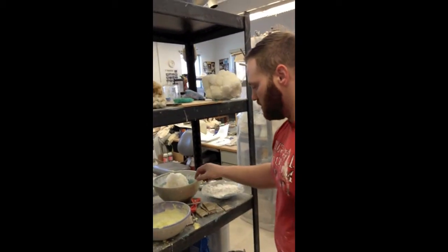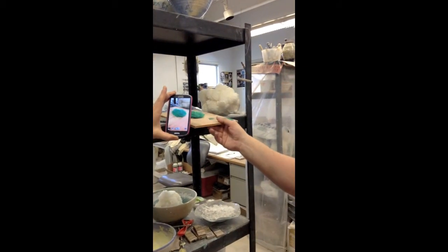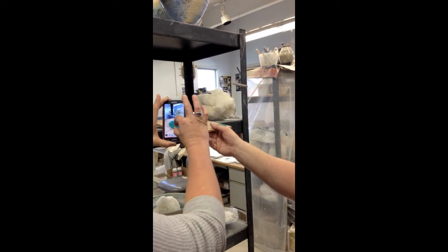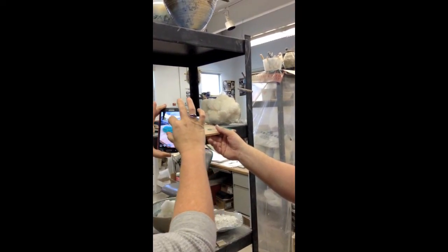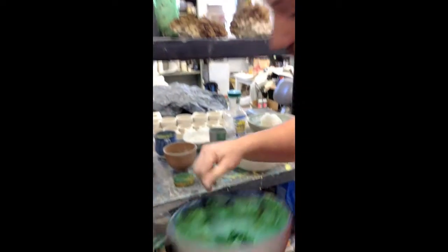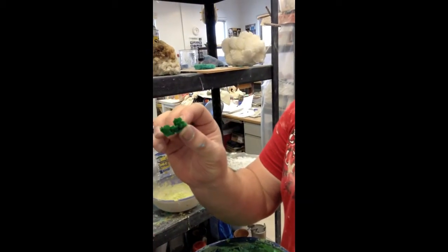I love the turquoise one that looks hairy up there. This one up here, what is that? That's a copper chloride. Yeah, hold real still. Let me see if I can get the detail on that. Look at those hairs in that crystal. It's really beautiful. The interesting thing is those have really crazy beautiful hairs, and if you grow them in a different way, at a different temperature, they instead grow these kind of stalactite shapes.